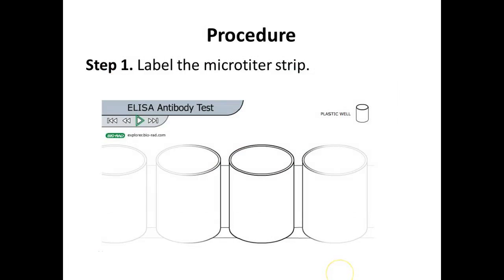So, really cool stuff. So for today's procedure, we only get one color. No fluorescence. Not today, except for our E. coli. You're going to start with a microtiter strip, right? And I'll give you one, and when we're done with it today, it can just go in the trash. We're just dealing with proteins today. Nothing pathogenic. You don't have to wear gloves. You can if you choose to. But it's not anything that's going to hurt you. It's actually all antibodies.